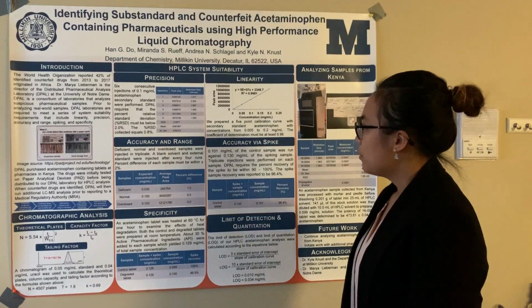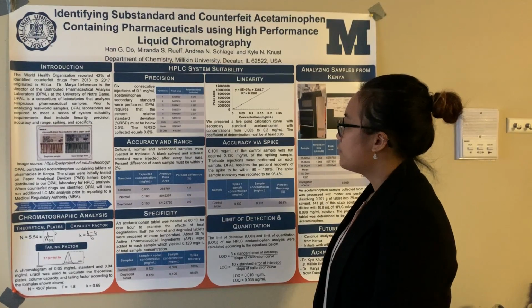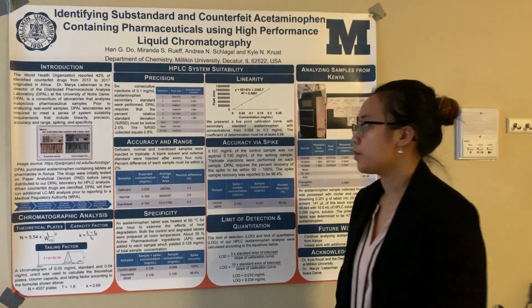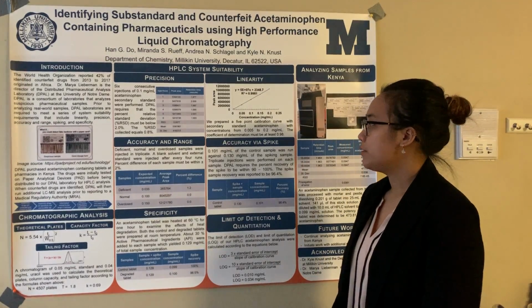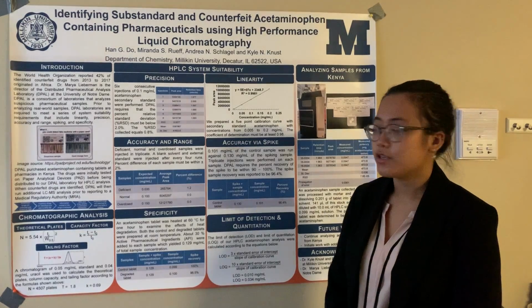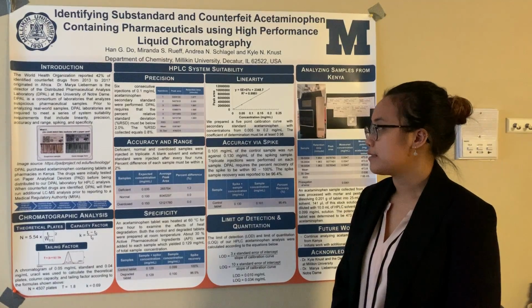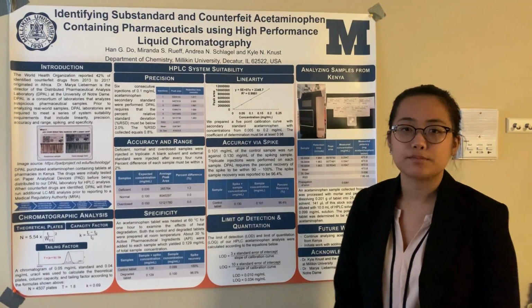Precision. Six consecutive injections of 0.1 mg/ml secondary standard acetaminophen were performed. DPAL required the percent relative standard deviation to be below 2.0%, and the percent RSD I collected was equal to 0.8%.